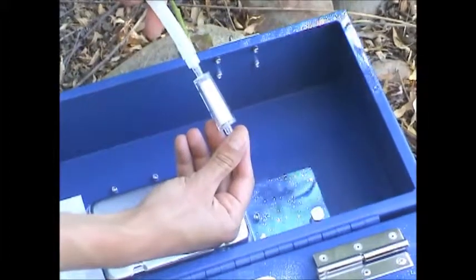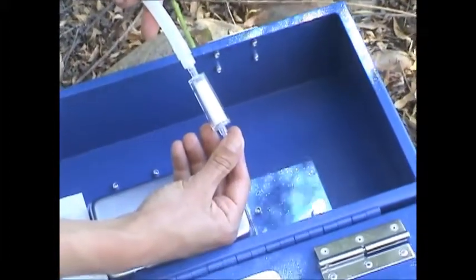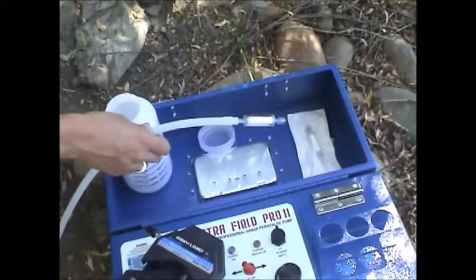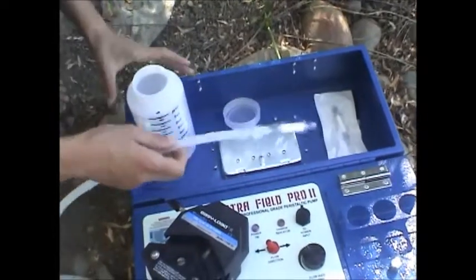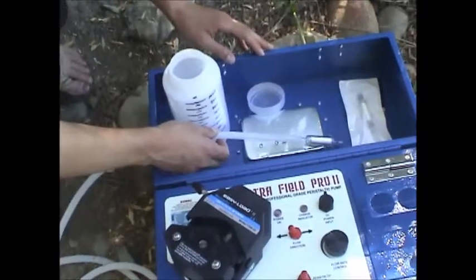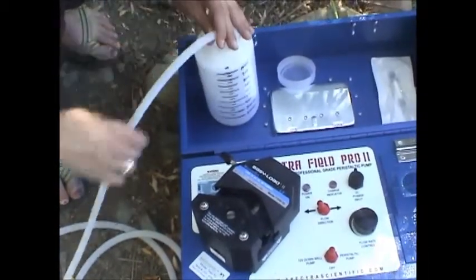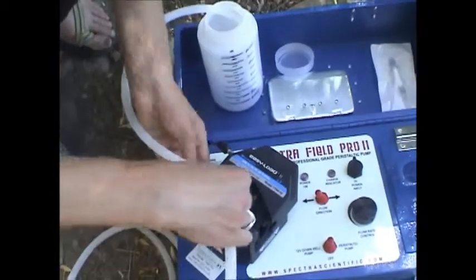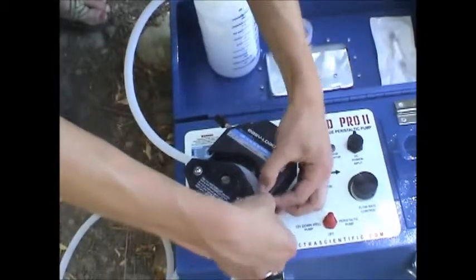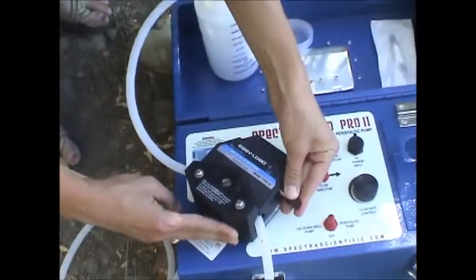It's very important that you get the column oriented in the proper direction. It's a one-way system, so if you don't install it properly, you're not going to get any filtered water flowing through. Now we just need to secure the column somewhere convenient and hook up the line through the pump head. Clamp it down.